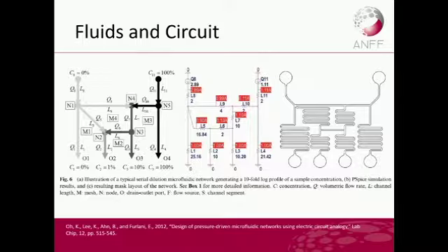Then why am I having to calculate all this out? Well, you have to look at what software that is, and also the computer power that's required to generate and simulate certain flows. So this is probably just a nice, quick sit-down and draw-out, rather than sitting down with a powerful PC that probably requires a bit of time to run as well.